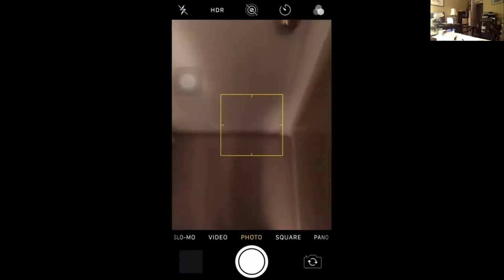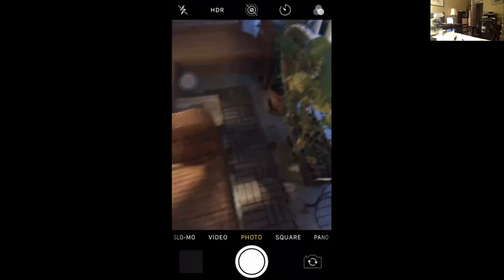All right, so we're out on the porch, and normally you do your site assessment. I can put in more details about how you'd actually pull from a plant, but we're going to take a sample from this little planter right here. On my video, I'll use my flash so you can see. All right, so we've got our little apple core. I'm going to pull from over here. Let's dig in. Get a little 3-inch plug right there. Perfect. We've got a nice little 3-inch plug.